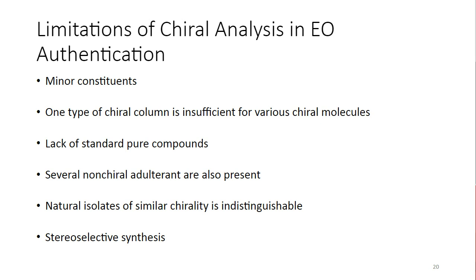But if you look over all other parameters, chirality, synthetic markers, and if you do chemometric analysis, you'll definitely figure out if adulteration is there or not. Thanks a lot.